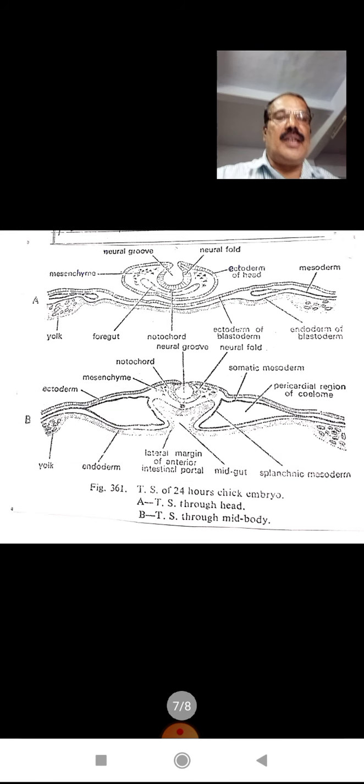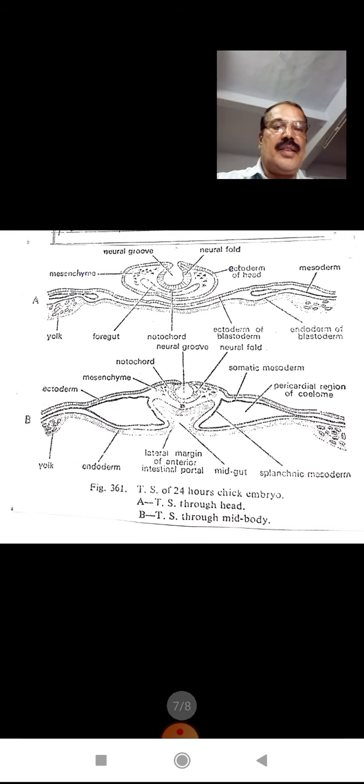Later I will discuss the TS of 18 hours chick embryo and TS of 24 hours chick embryo.